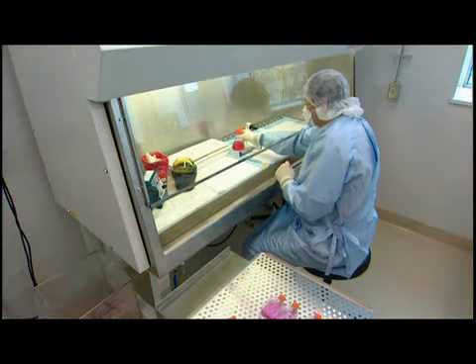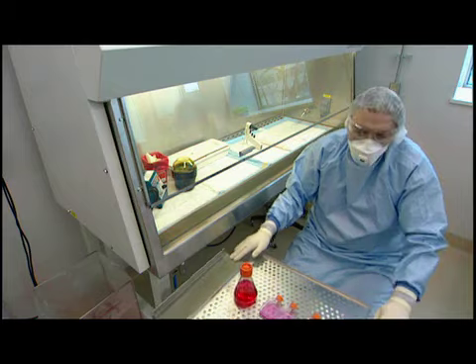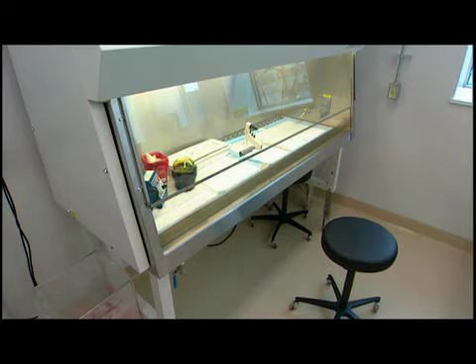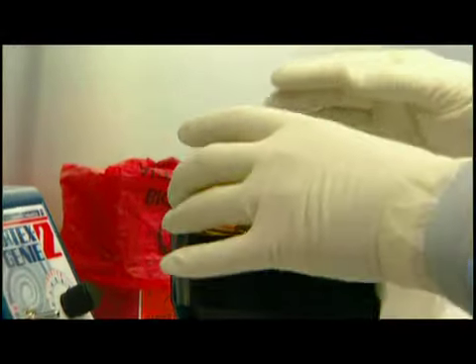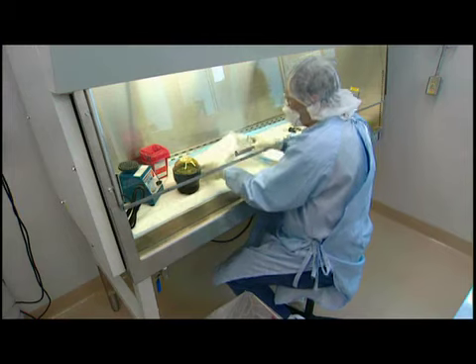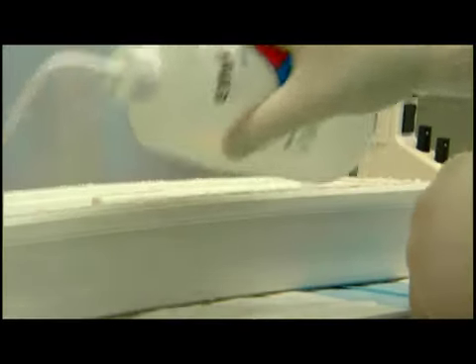When you've done your work, allow the cabinet to run for 5 minutes with no activity. This will allow the BSC to purge airborne contaminants. Place all material into biohazard bags within the cabinet. Close any open containers. Surface disinfect all objects that came in contact with contaminated material.